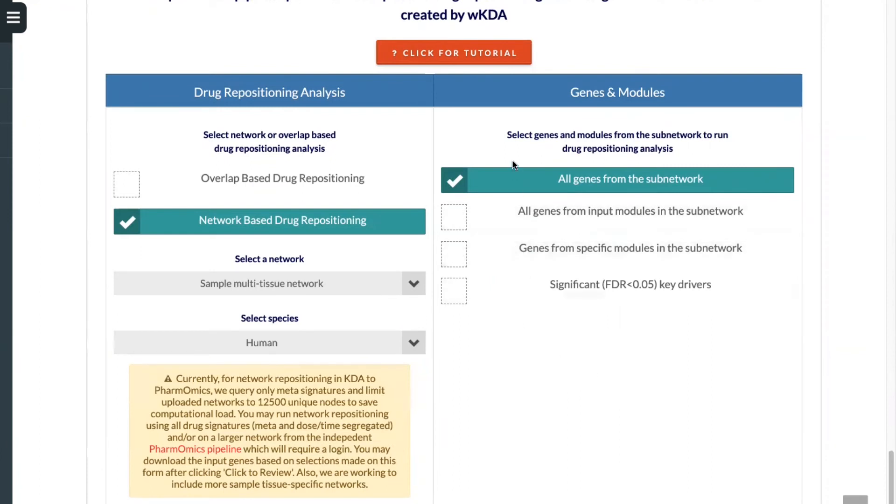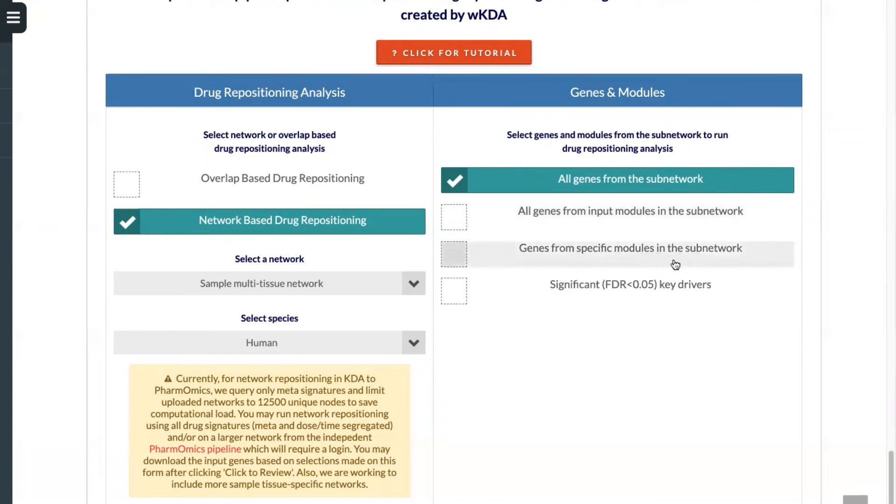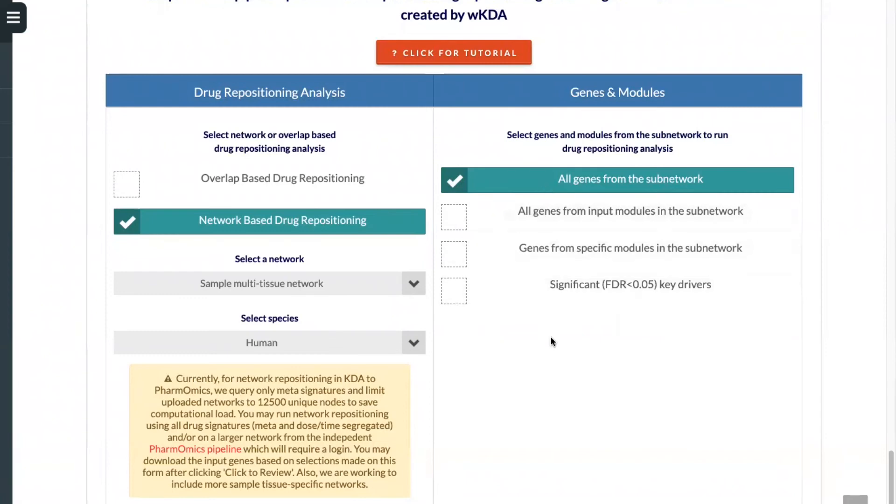Here, you can select specific genes and modules from the sub-network to run drug repositioning analysis. You can select all genes from the sub-network, all genes from input modules in the sub-network, genes from specific modules in the sub-network, and significant key drivers that pass an FDR of less than 0.05. Here, we'll use all genes from the sub-network.